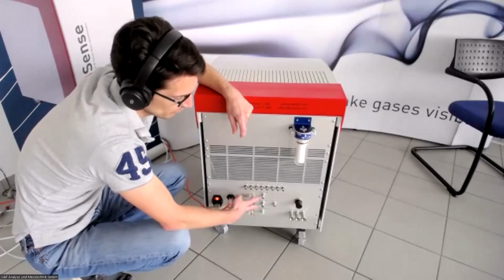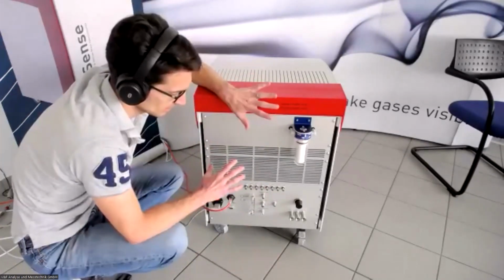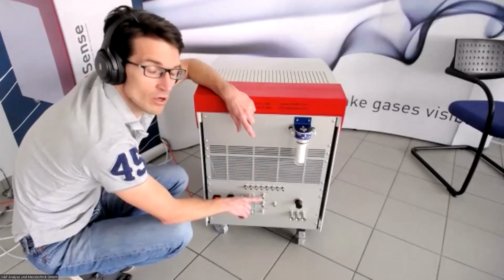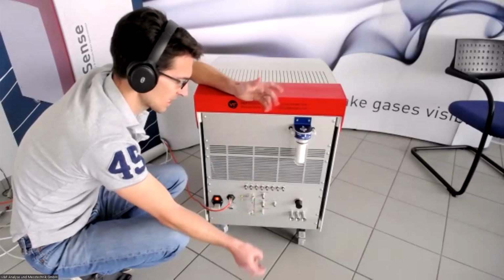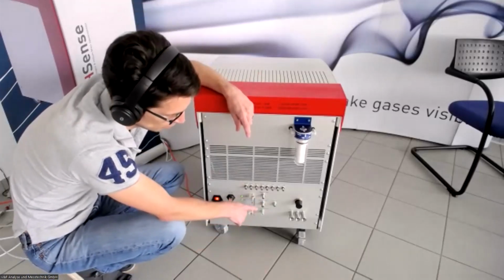So the sample pump will attract gas through the sample inlet. Inside, the analysis will be done and all the gas that is not used will be put out on the sample out port. And the whole vacuum system will vent the gas that is drawn from the high vacuum through the vacuum out port.